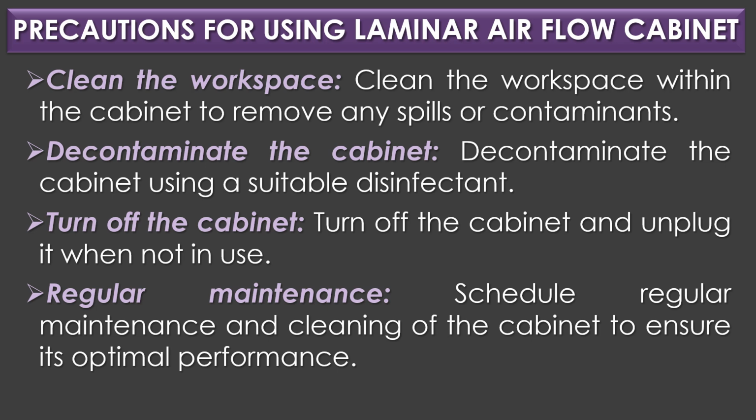Clean the workspace. Clean the workspace within the cabinet to remove any spills or contaminants. Decontaminate the cabinet. If necessary, decontaminate the cabinet using a suitable disinfectant. Turn off the cabinet. Turn off the cabinet and unplug it when not in use.